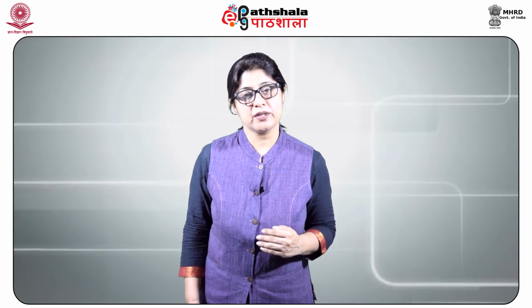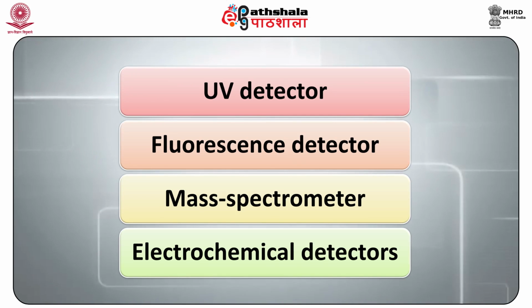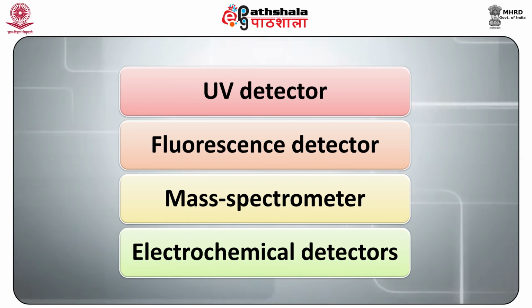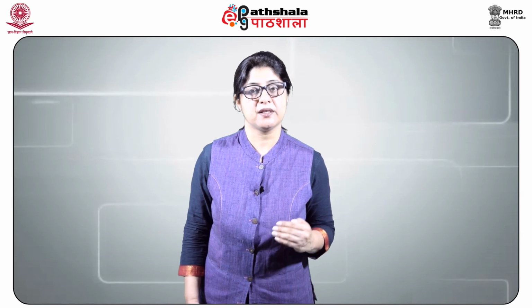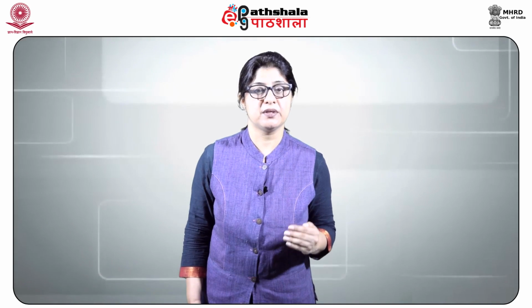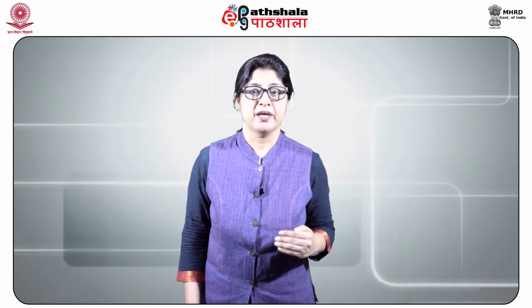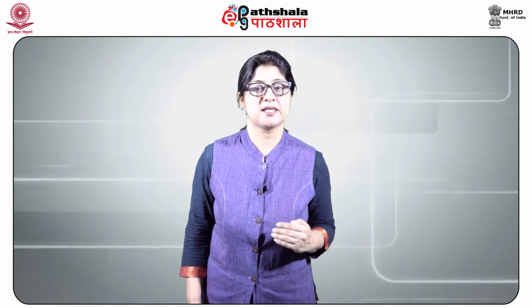Detector. Since the quantity of material applied to the column is very small, it is imperative that the sensitivity of the detector system is high. Commonly used detectors are UV detector, fluorescent detector, mass spectrometer and electrochemical detectors. LC-MS is also used to develop highly precise and reproducible assays. Modern day mass spectrometers are extremely sensitive and LC-MS assays are now viable replacements for many immunoassays. LC-MS assays will possibly be most beneficial in the clinical biochemistry lab when used for multiplexed and screening type assays.